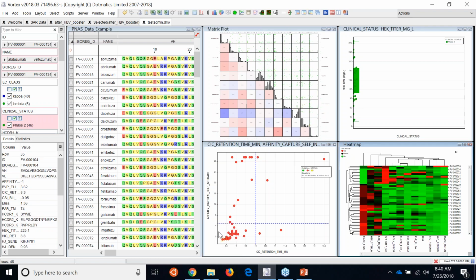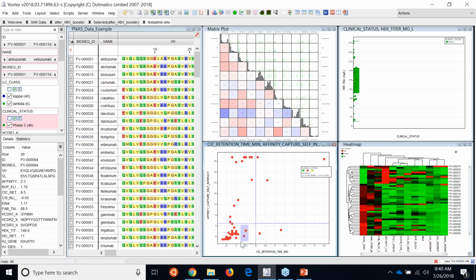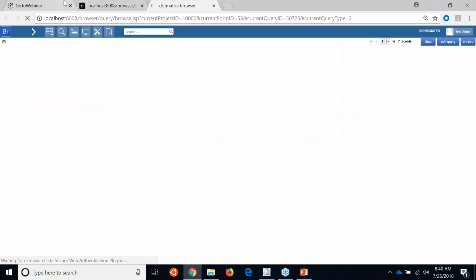And then we can use the capabilities here to do some filtering. Maybe we'd like to select some sequences here. I've got 7 selected sequences. The profile looks good, and I can push this back into my web view that I was previously in.